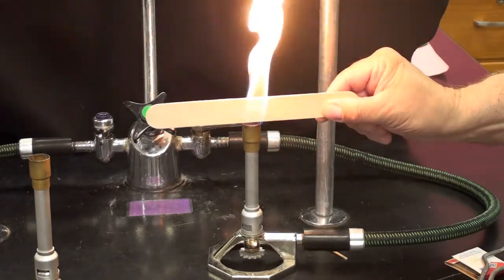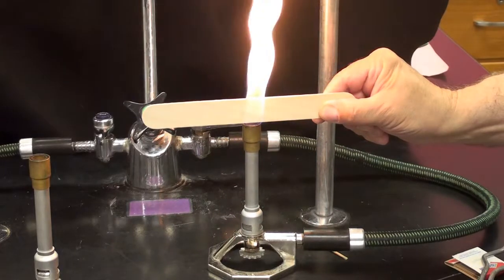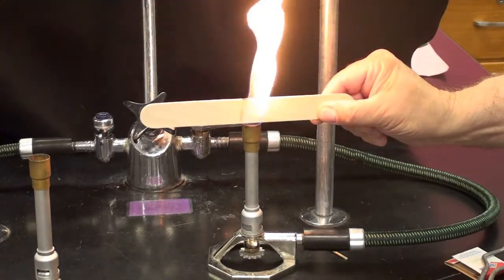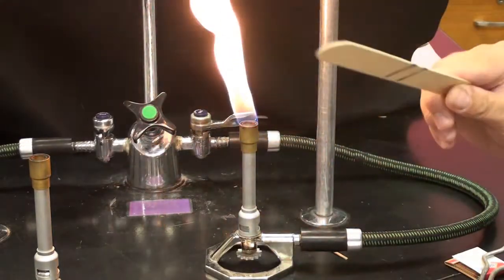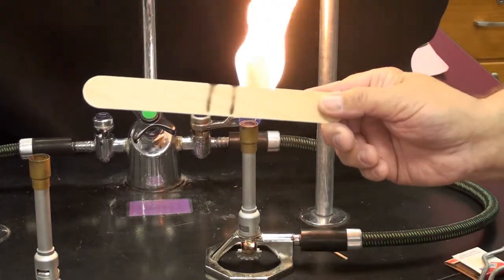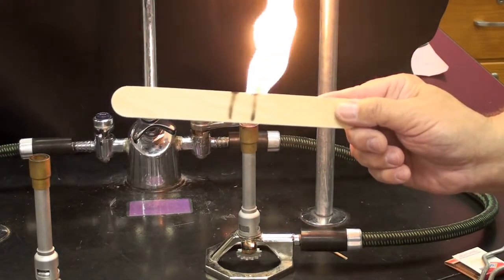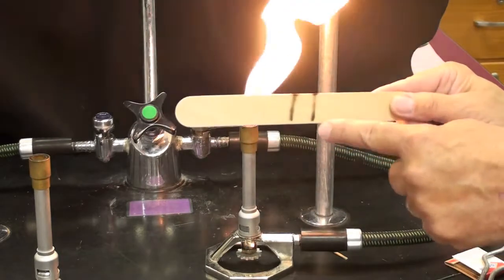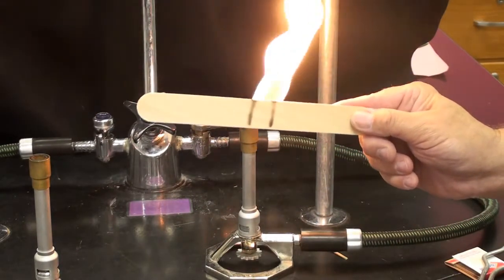Let's try this piece of wood, just going across it like so, I'm not really plugging it up. So that's an interesting characteristic. It looks like it's burning on the outside of the flame, the outside of the barrel, but the inside part wasn't burning. That means it must not be as hot there.